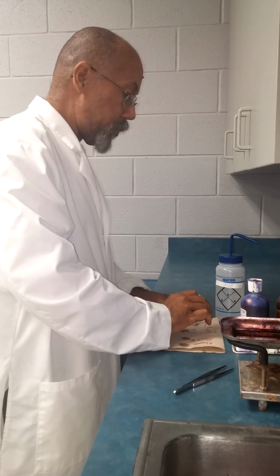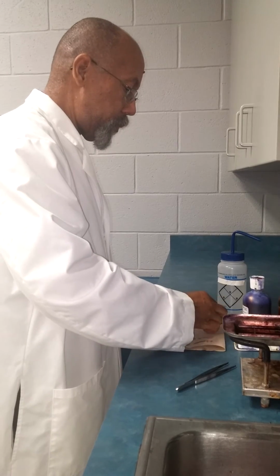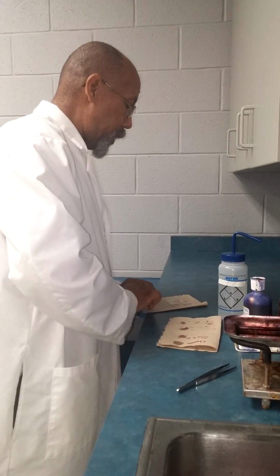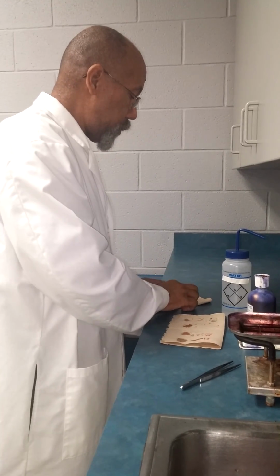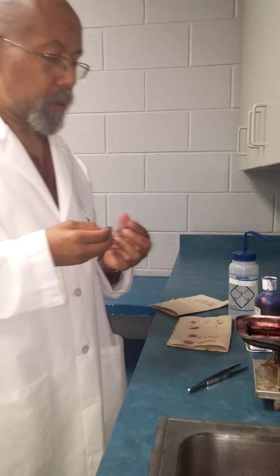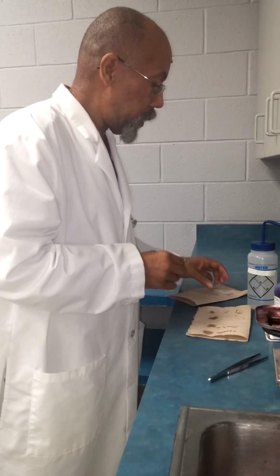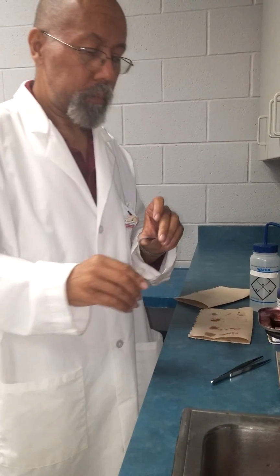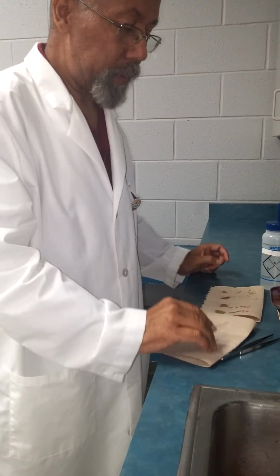Simply let the slide dry with just the air. So I like to blot it a couple times to make sure my slide stays dry. And now at this point, our slide is ready to be read using a microscope. And that is the Gram stain method for staining bacteria.